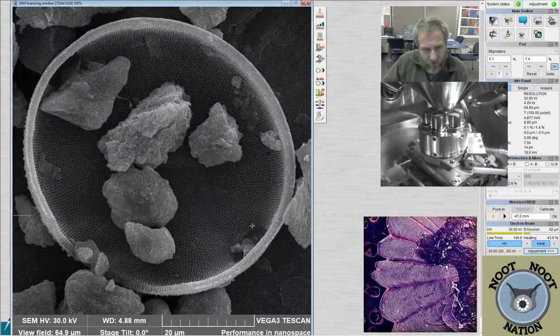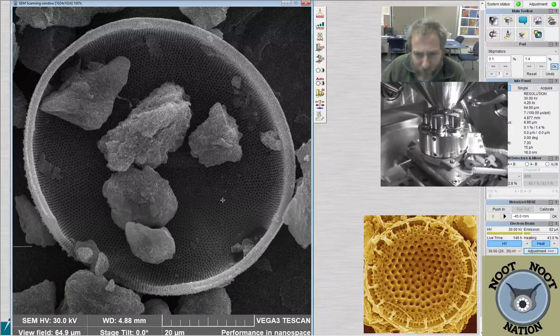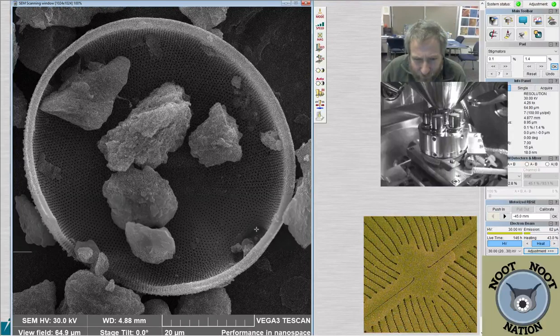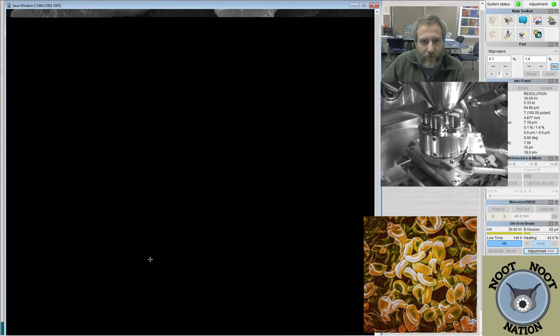And as it crosses over, you can see it's scanning here. It's building the image as we go. You can see into the actual ocelli, the elevations or depressions, depending on which way you're holding the valve. And then you can see those little tiny holes are actually visible inside, if you're very careful, look in there. It's nice and highly focused, which is the way I like it.